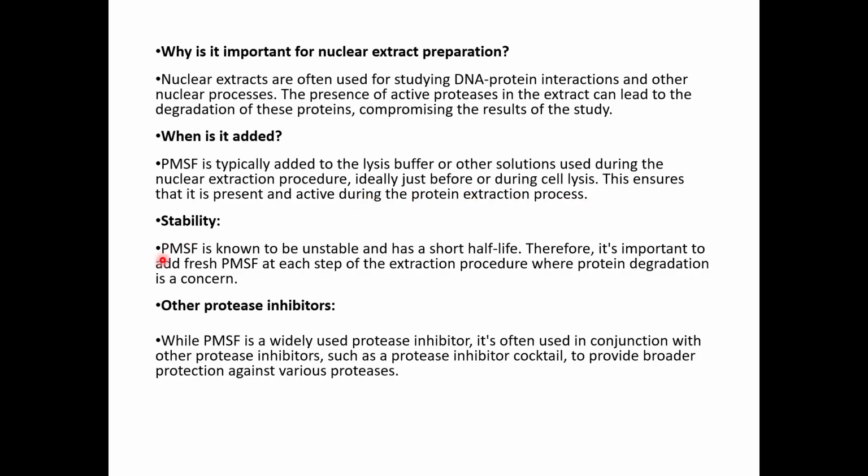Then the stability: PMSF is known to be unstable and has a short half-life. Therefore, it is important to add fresh PMSF at each step of the extraction procedure when protein degradation is a concern.